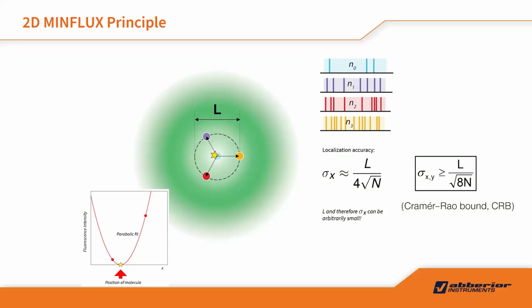Okay, if we reduce the error from 100 nanometer to 10 nanometer, for example, and we still want to reach the 1 nanometer accuracy, in that circumstance, you only need 100 signal photons, right? 100 signal photons, square root is 10. 10 divided by 10, it's again 1 nanometer. So by controlling the error, reducing it from a large error to a small number, the requirement for the total signal photon counts is much reduced. That's why the accuracy is very high.